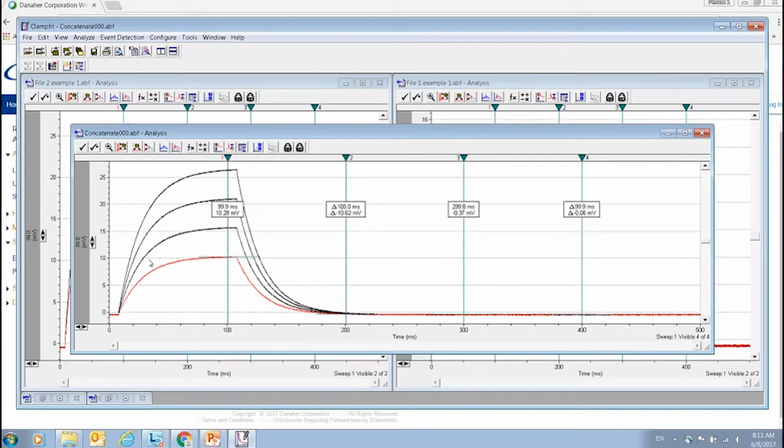You can see a new window pops out with the traces combined together. So this is very fast and straightforward. However, one disadvantage of this method is that it won't allow you to choose which trace you want to combine. For example, you have a file with 1,000 traces, and you only want to illustrate one of them. So how would you be able to do that? Next, we are going to introduce another method.